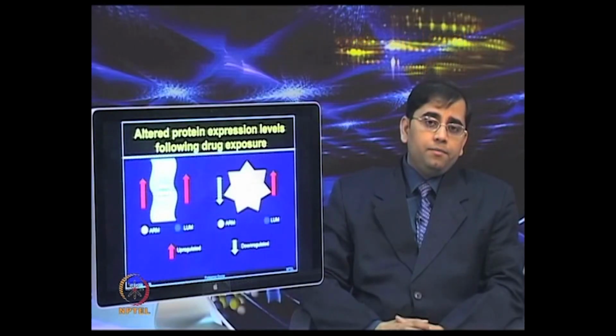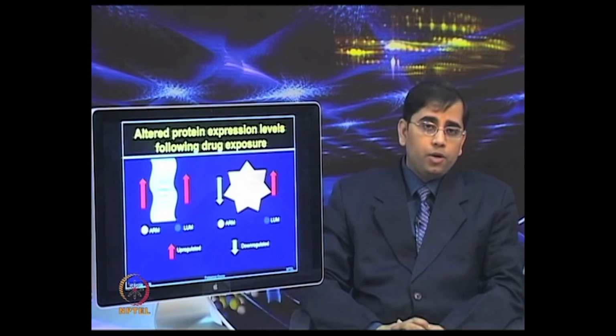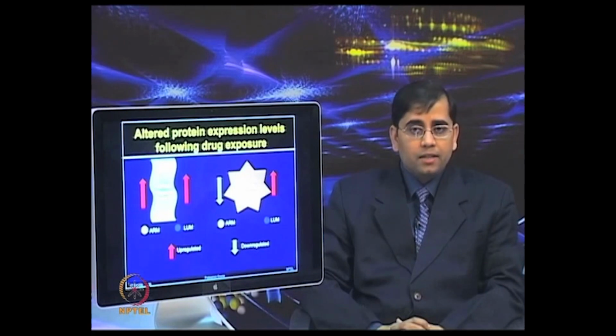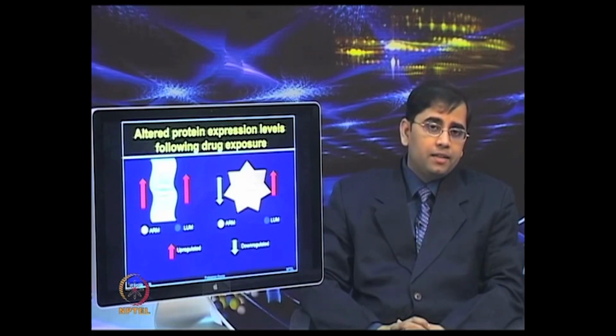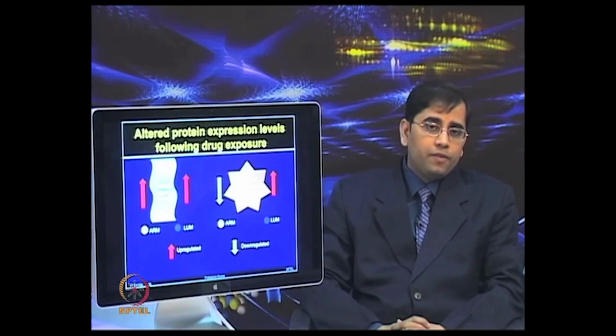Interestingly, the ARM treatment resulted in more than threefold downregulation of the glycolytic enzymes such as enolase, phosphoglycerate kinase, fructose bisphosphate aldolase and glyceraldehyde 3-phosphate dehydrogenase.